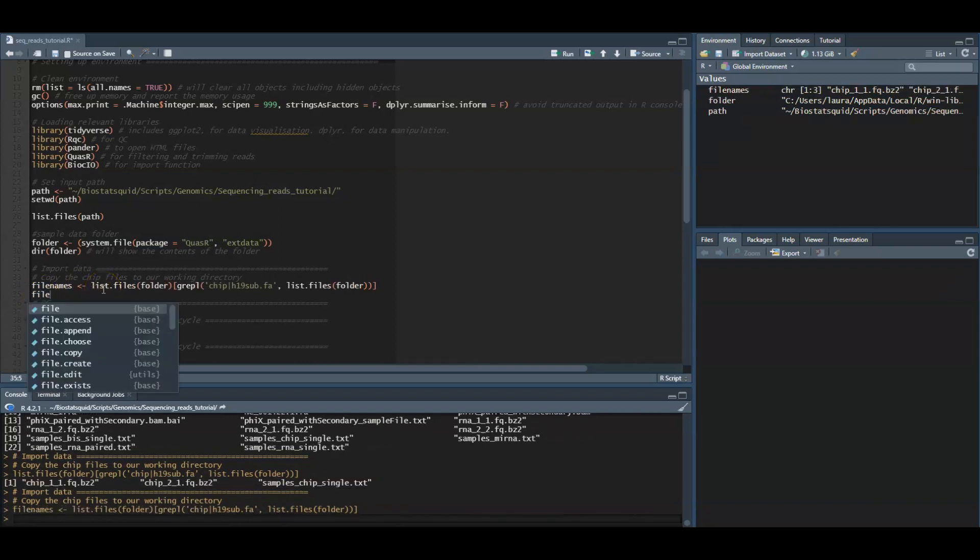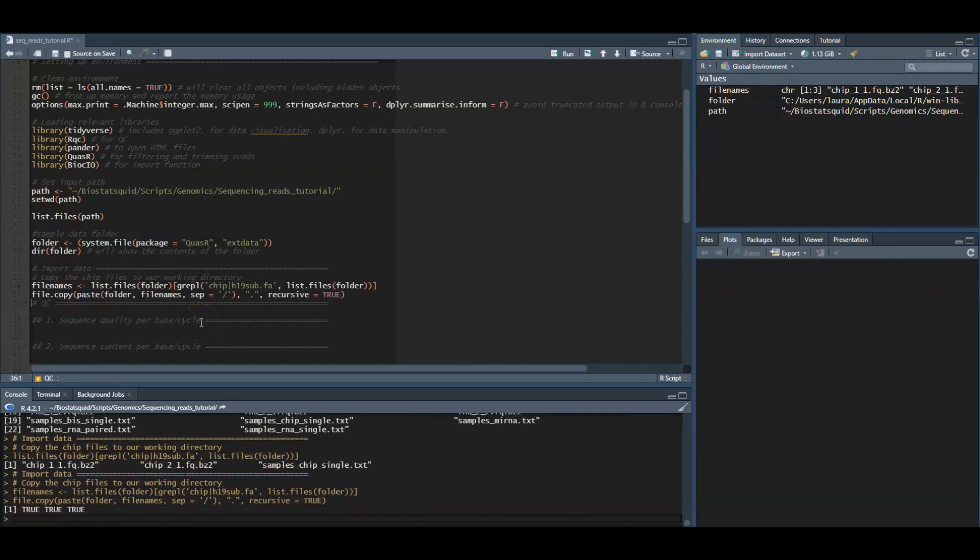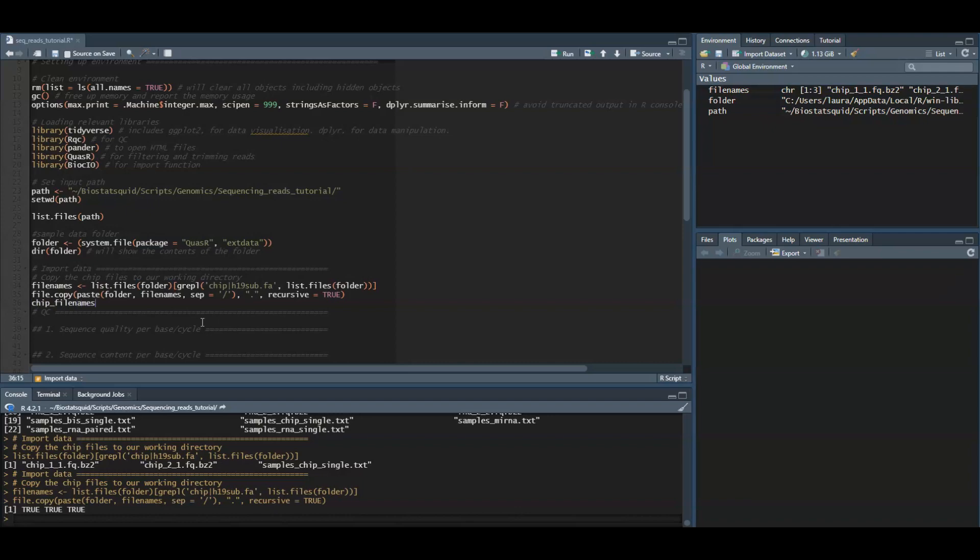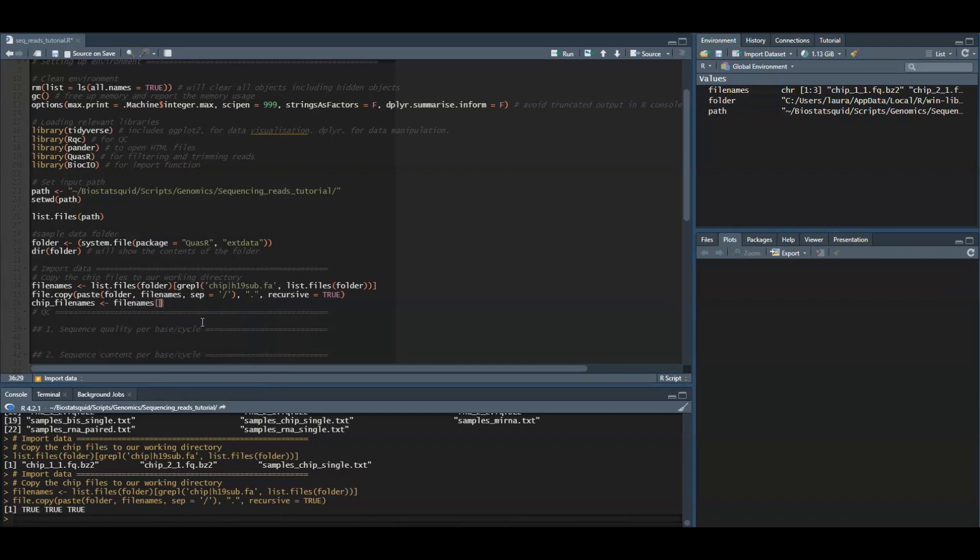Now we will copy the files listed in filenames to our folder and we will also create another object called chip filenames which will only contain the two files with the ChIP data. The two FASTQ files with the ChIP data.